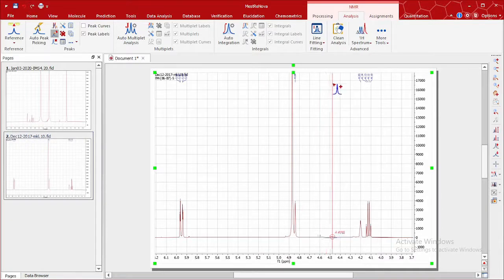When you see this, for example, we can say that this is a very good peak because we can see their height. These others do not have a very good intensity. Compared to this, we can normally say that these are very good peaks responsible for this particular compound. And these may be as a result of impurity, artifact, or solvent impurities. So this is pick by pick.